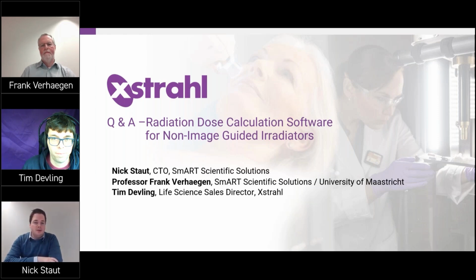The 96 well plate one is just a standardized well plate that we had technical drawings from, but you can in theory also do others. The culture tab that generates the well plates is an analytically generated geometry. But if you would make a custom geometry of those tubes, I'm not too familiar with how all the different cell culture geometries look, but you can make them with the geometry designer and then import them.